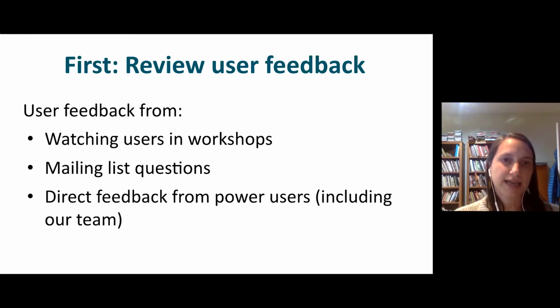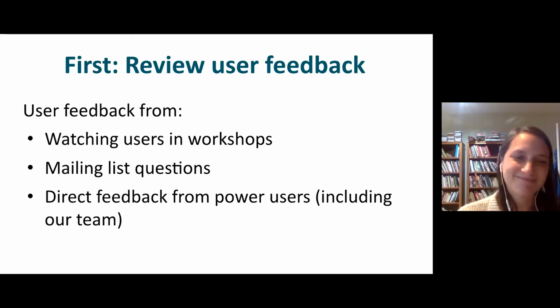We also looked at mailing list questions. Even if somebody asks a question and I have a help page up for it, so I can just point them to that, the fact that they're asking the question shows that it's not necessarily intuitive from the interface itself how to get to the graph or the analysis that they're looking to do.